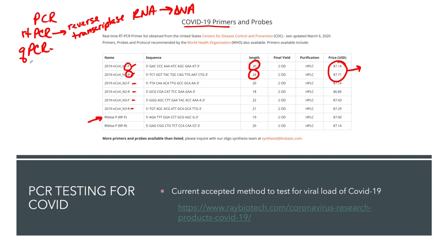This is detected with the camera in real time, so instead of looking at sequences, we will see a fluorescence signal start to rise with an increasing amount of PCR product. And once that PCR product crosses a certain threshold, we now know that it's present, and that it was present in the original sample. So that's done in real time, and we can actually watch the replication occur by the fluorescence signal on a computer as it is occurring in the PCR thermal cycler.